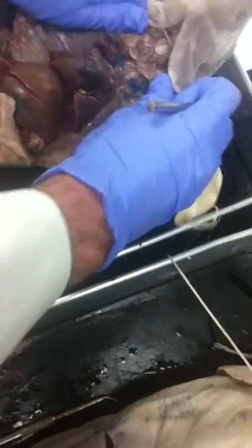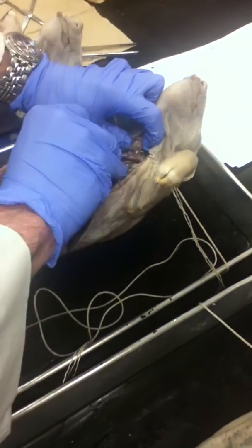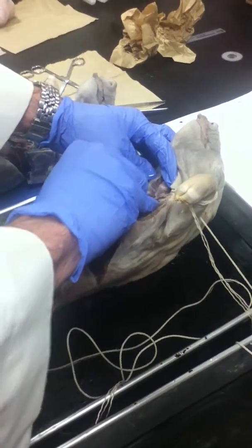I'll just pick a different pig here. Now this here underneath, that's the esophagus. Okay. That's the food tube, right there.